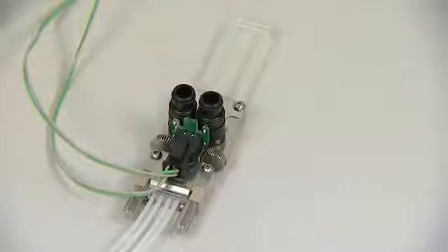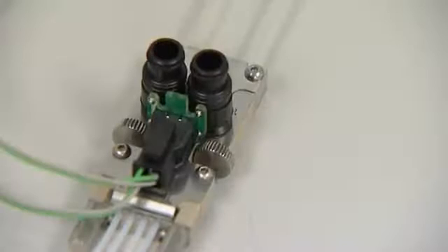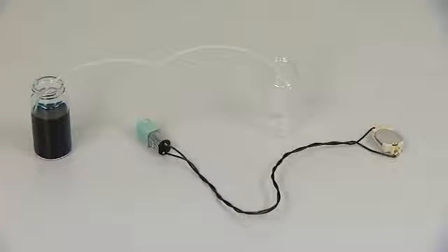If you need low power consumption and small size, then electro-osmotic pumps are ideal, delivering smooth flow and pressures up to 20 bar.